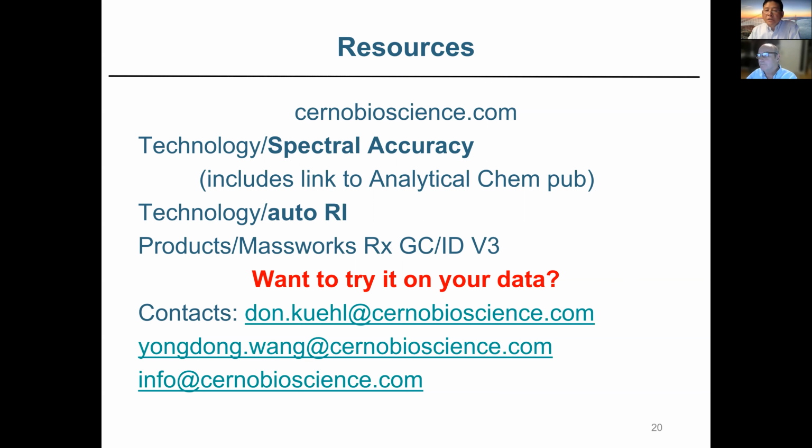The last question here, unless additional questions come in, is what if the user would not want to change their current workflow? They want to keep it as is. Well, because we can handle data, we basically read the instrument data file after the acquisition, and we can do all the processing. So one way to look at it is you can run our process in parallel to your current workflow, and since we can work with centroid mode data, which is probably what your workflow wants to work with, that's fine.